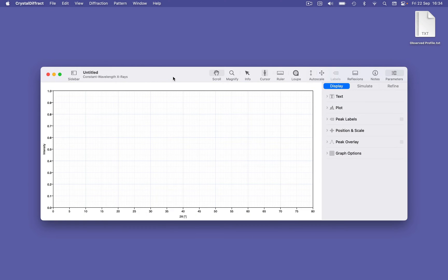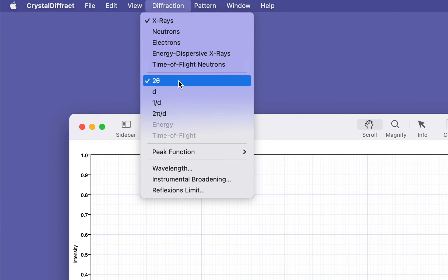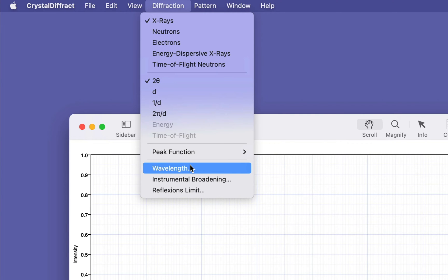When working with experimental data, it's best to start with an empty document and set up your experimental parameters before you import any data. Here I'm going to set up a conventional laboratory x-ray diffraction experiment using the diffraction menu to specify experiment type, constant wavelength x-rays, x-axis type, and degrees 2 theta.